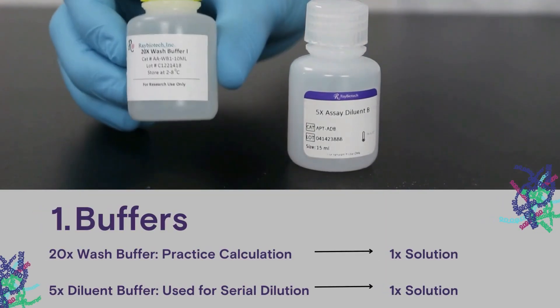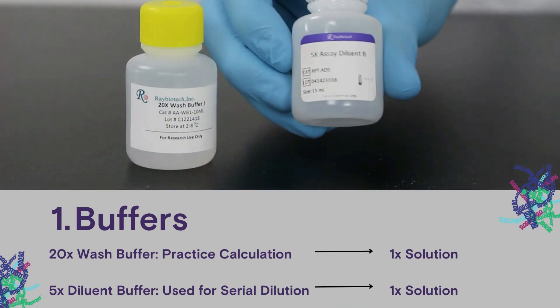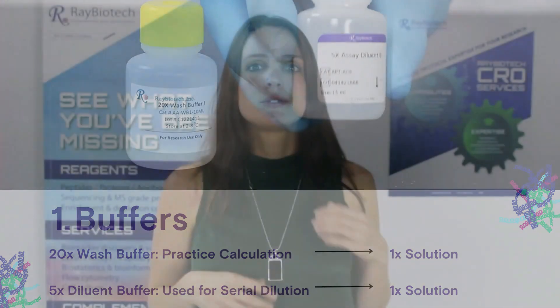We have a 20x wash buffer that we're going to use for a practice calculation, and our 5x diluent buffer that we use to dilute proteins. To obtain a solution optimized for our experiment, we'll have to dilute them to 1x concentrations. So let's start with our practice solution, the 20x wash buffer.